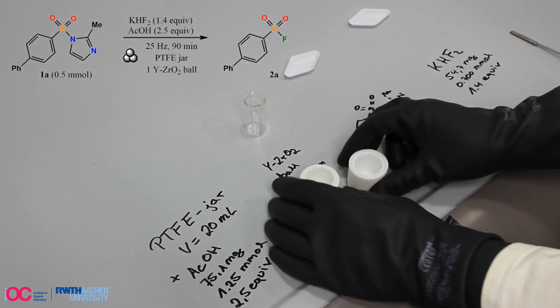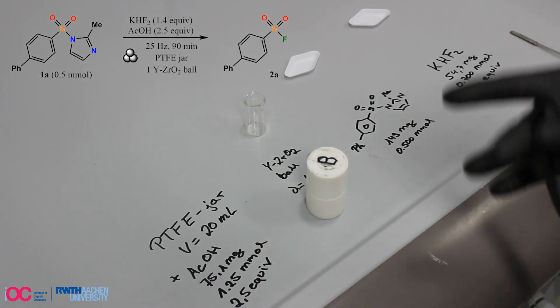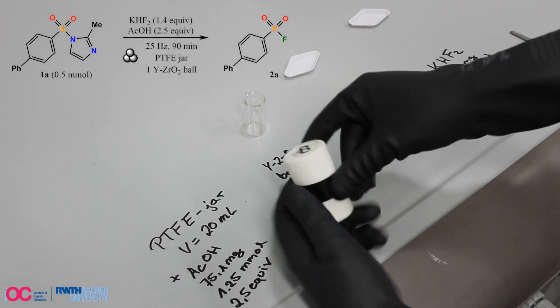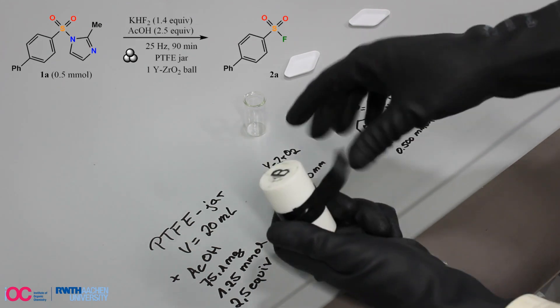After the addition of starting material 1A, KHF2 is added carefully. Please be aware that hydrofluoric acid may be formed during the addition of KHF2 to the acid. Wear protective gloves and add all reagents inside a fume hood.